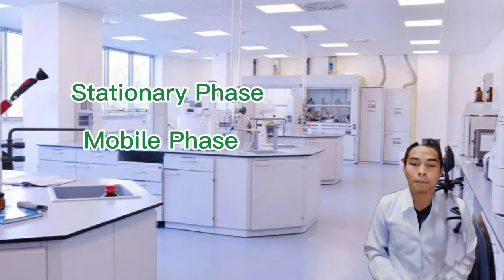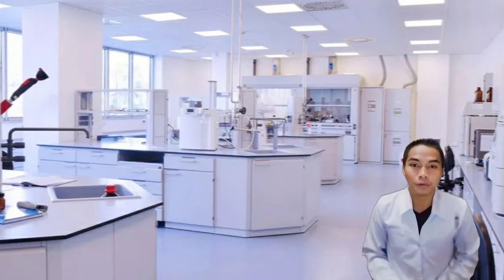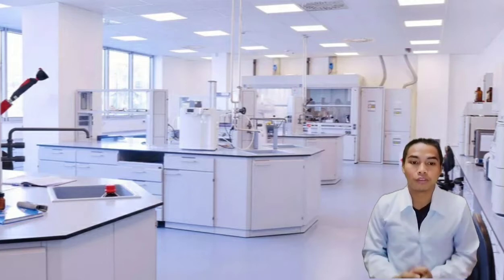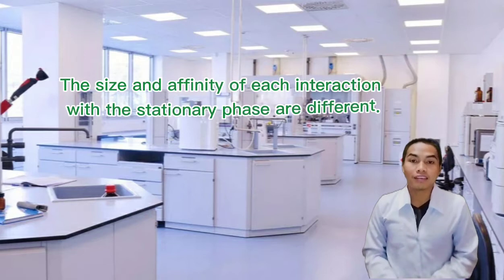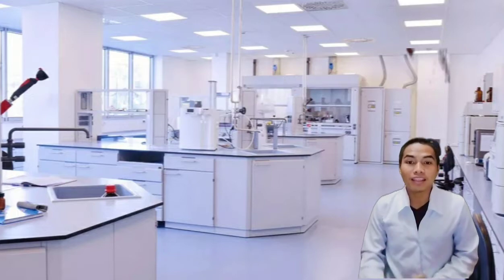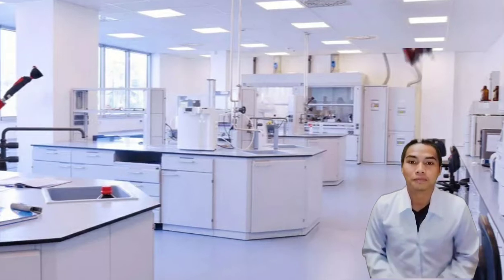Compounds in the mobile phase interact with the stationary phase as they pass through. Due to the differences in properties and structures of each component, the size and affinity of each interaction with the stationary phase are different. Therefore, under the same driving force, the retention times of different components differ in the column, thus moving out of the column in different orders.